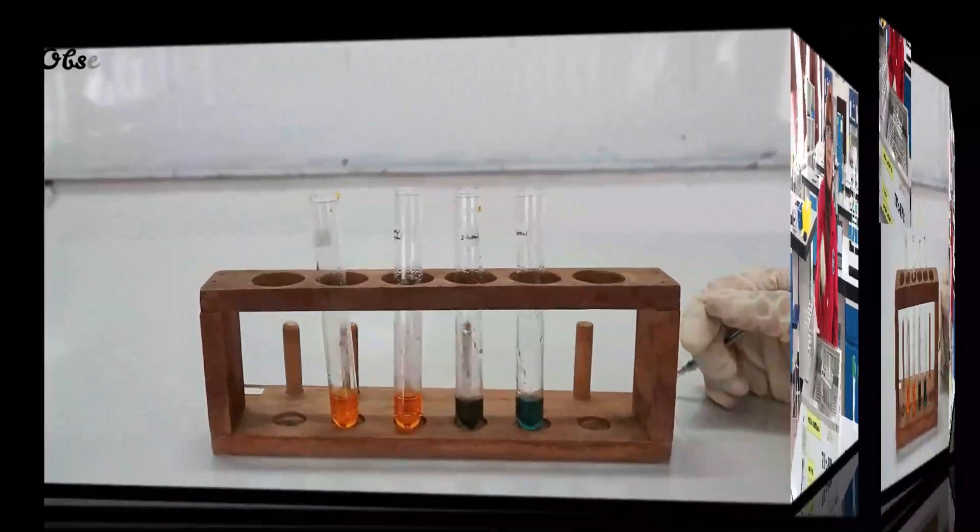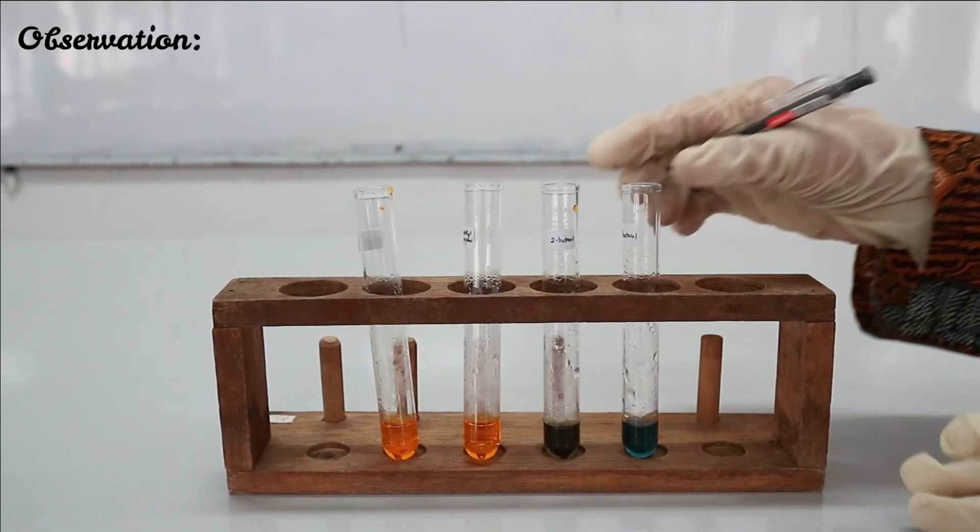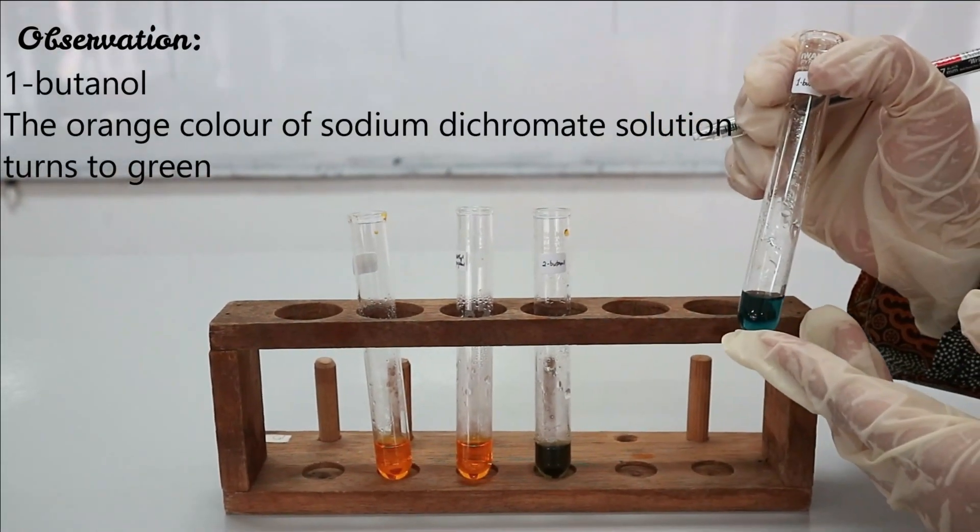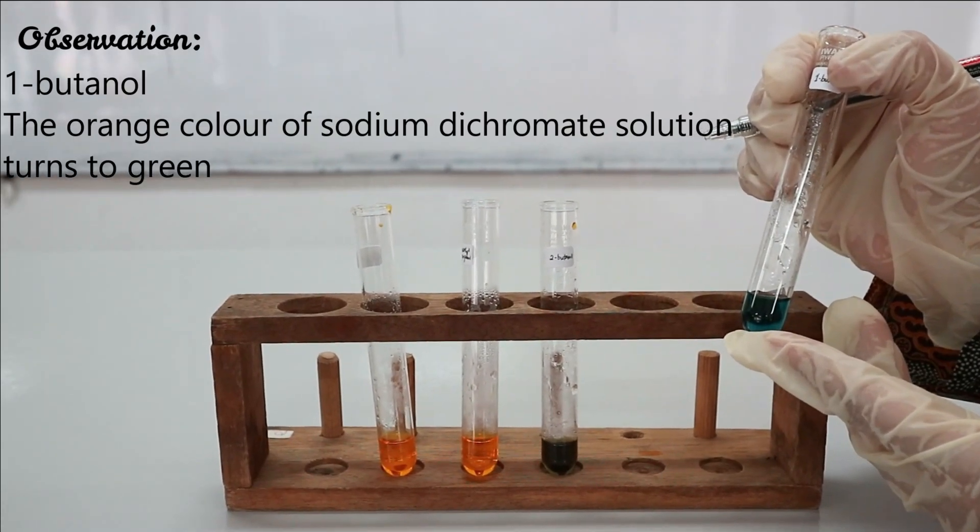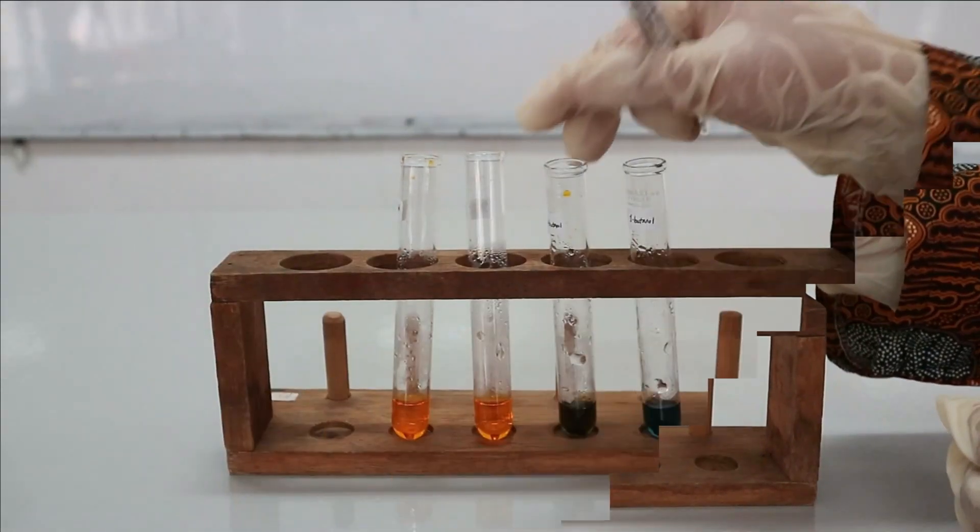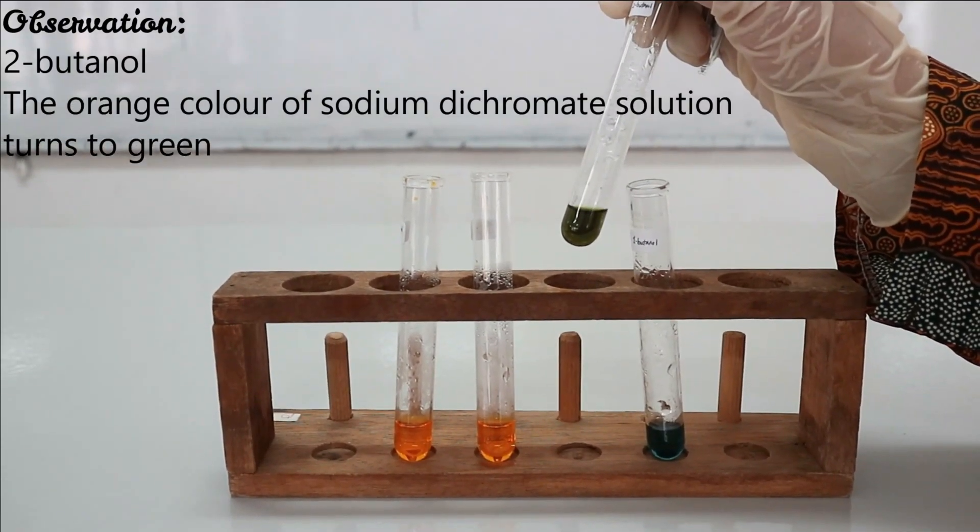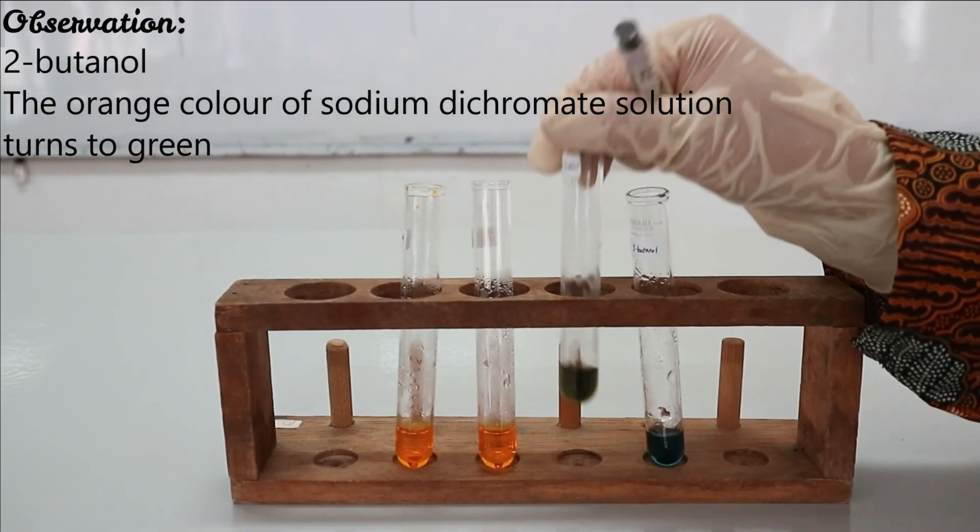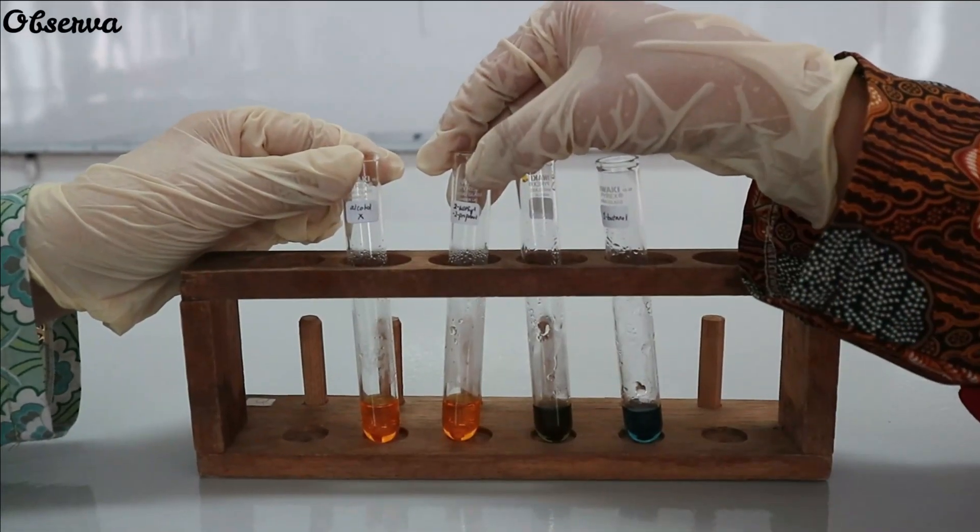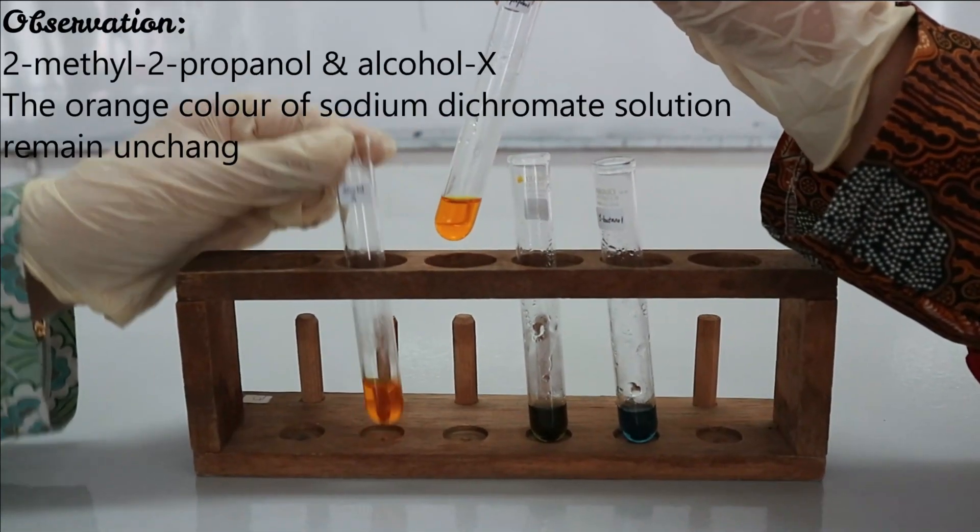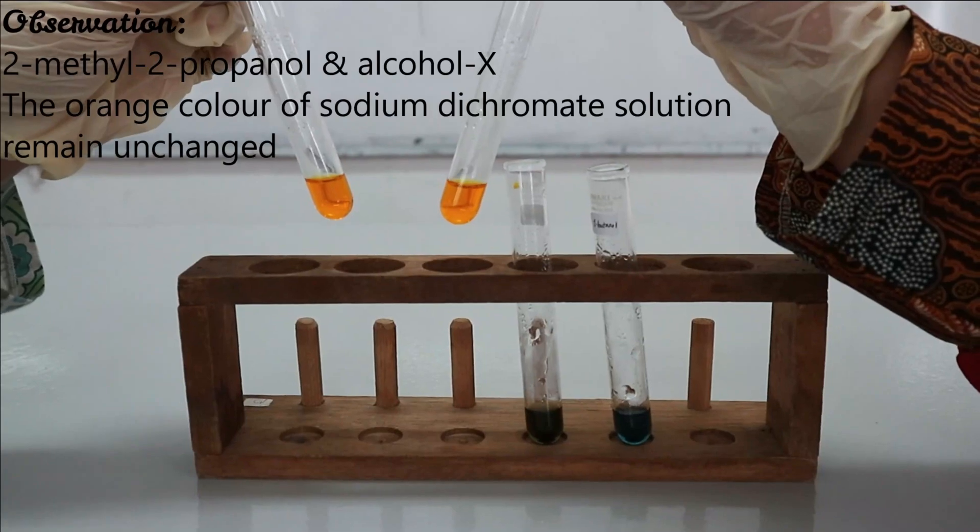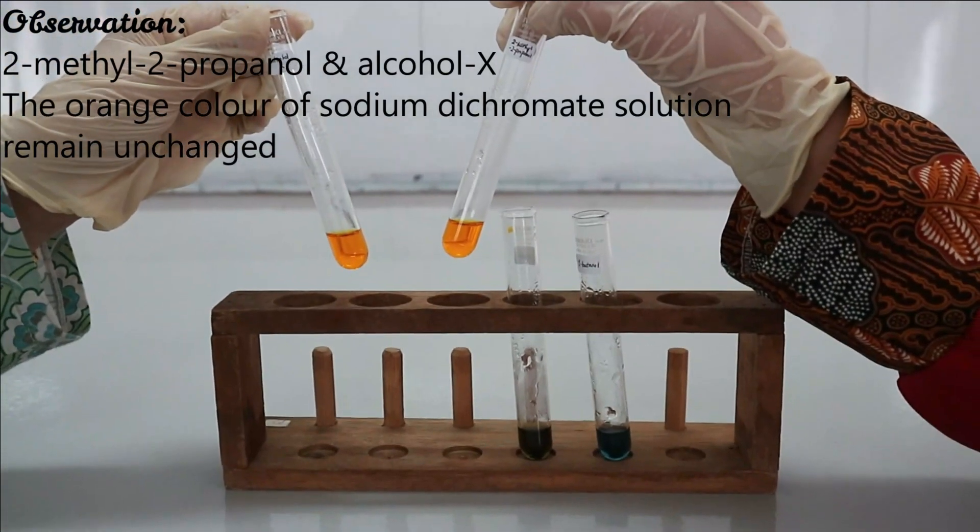Now record the observations. For 1-butanol, the orange color of sodium dichromate solution turns to green. For 2-butanol, the orange color of sodium dichromate solution turns to green. While for 2-methyl-2-propanol and alcohol X, the orange color of sodium dichromate remains unchanged.